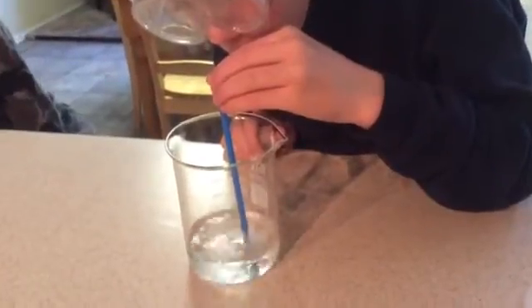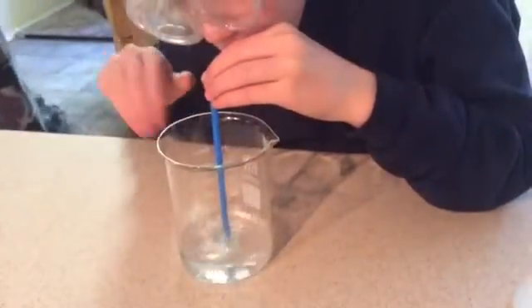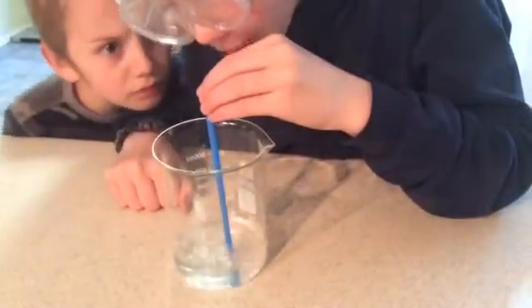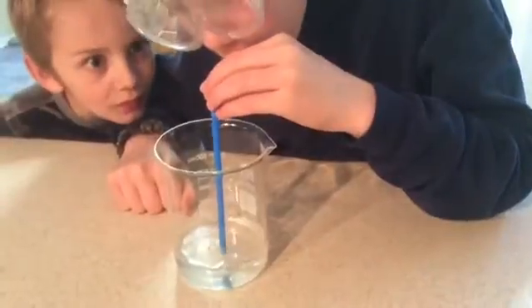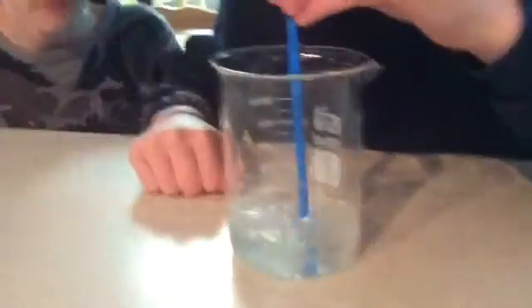Okay, so this is lime water and it's an indicator for carbon dioxide. Isaac is breathing into the water and his breath, of course, has carbon dioxide in it. And we should be able to see the lime water get a little cloudy.